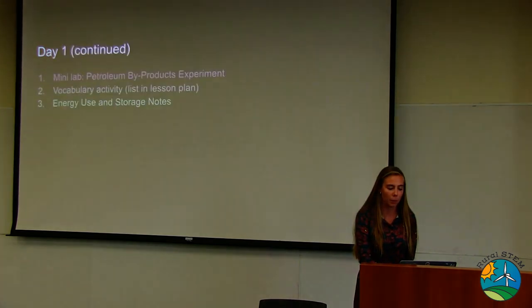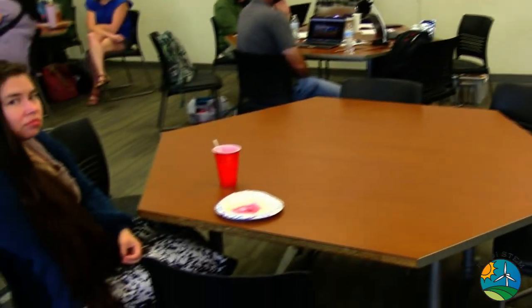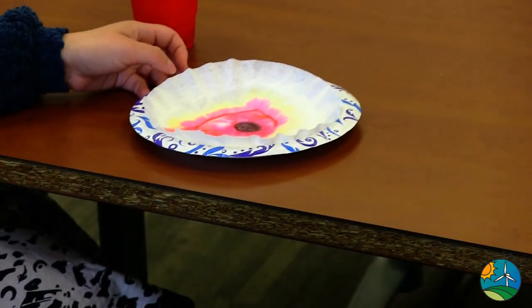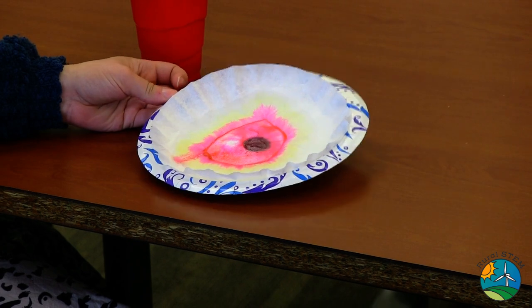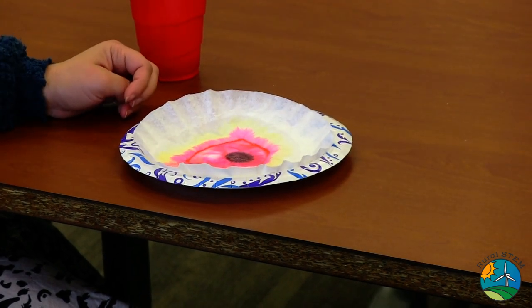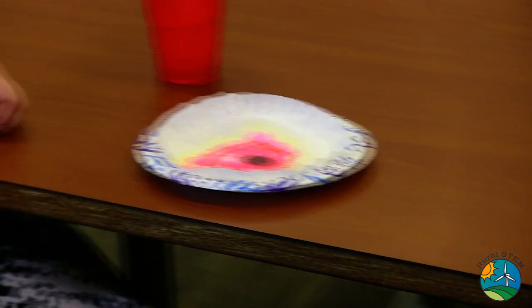All right, let's go ahead and look at our plates and see what we noticed. Can somebody tell me what colors did you see in each dot, but start with the color of your marker? My marker was brown, and first closest to the dot you see a bunch of red and then some orange, and now it's kind of spreading into yellow. Yellow. All right. Anyone else?